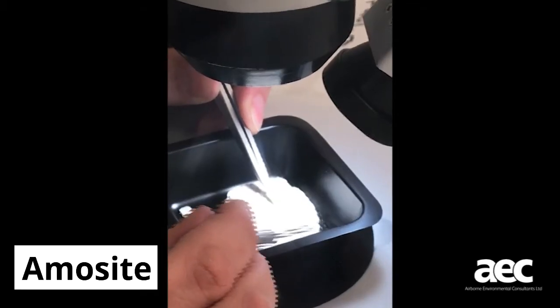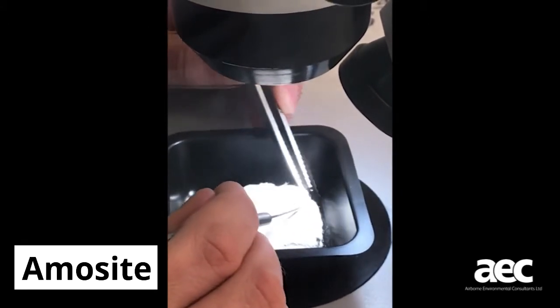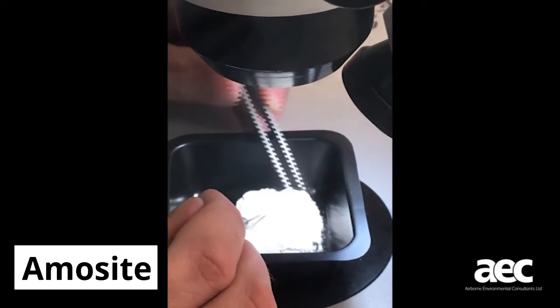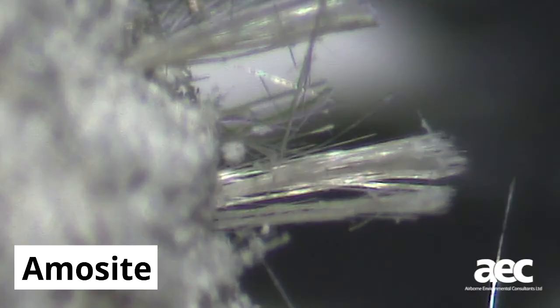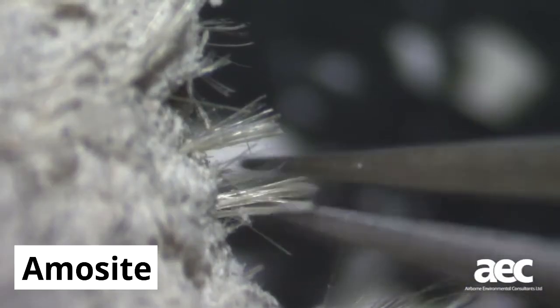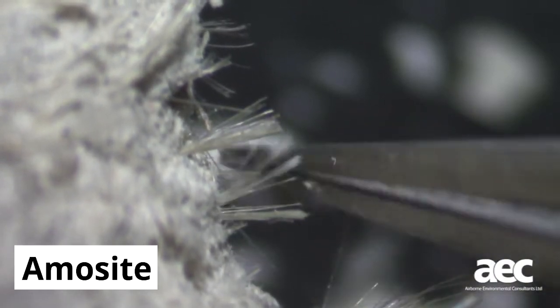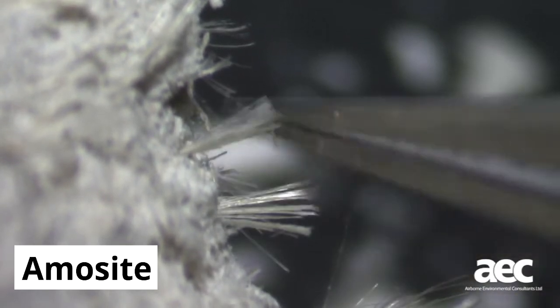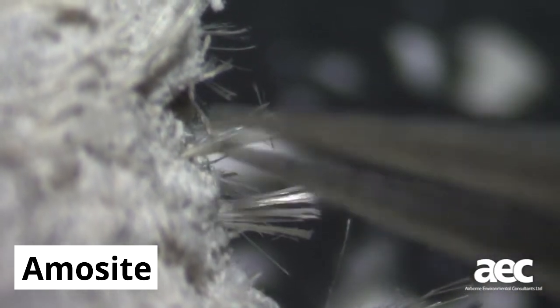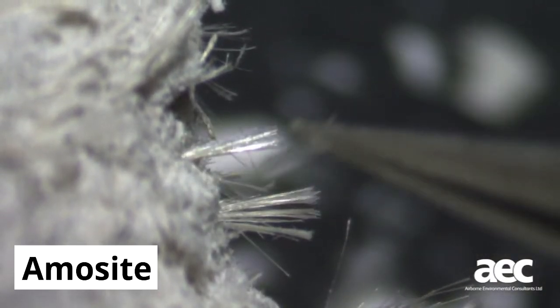Here you can see a sample of suspect insulating board. Firstly, the sample would be prepared and then assessed under the stereo binocular microscope. The analyst searches through a sample to locate and identify suspect asbestos fibres. Having identified the presence of fibres, the analyst assesses their morphology, or shape, to ascertain if they could be asbestos, and if so, which type of asbestos it is most likely to be.